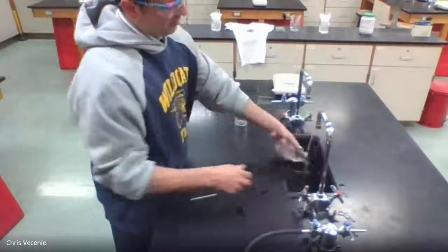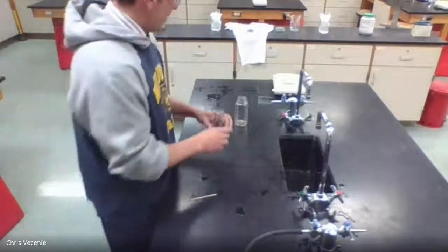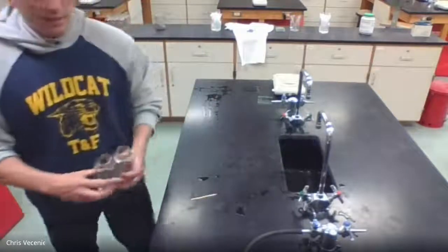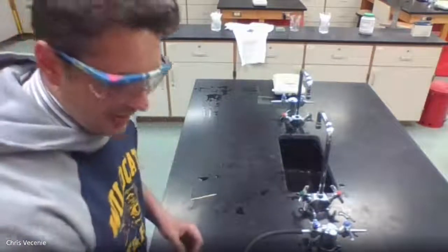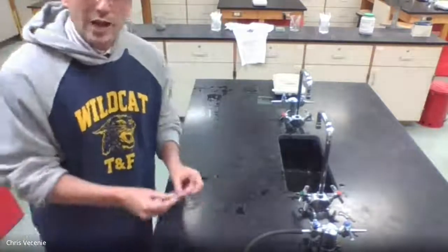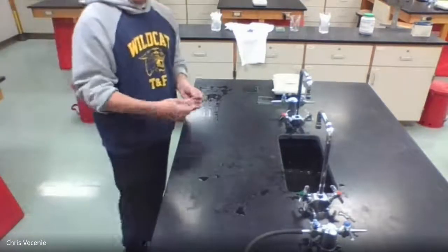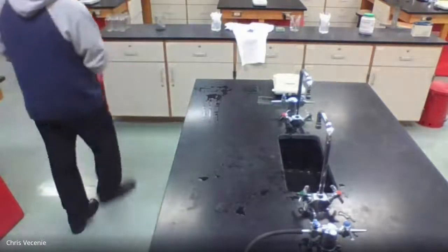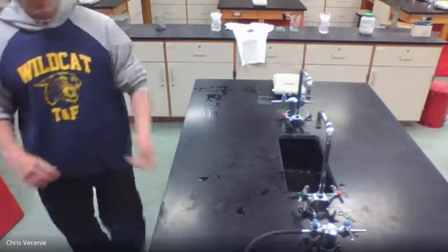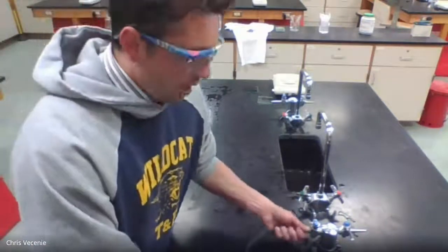And like you said, you never get to control the results of your experiment. Sometimes we see what we think we're supposed to see, but at the very least, we always have to explain our observations correctly. If I went and said, yeah, sure, our hydrogen diffused, that doesn't make sense based on what we saw. All right, so the key is making observations based on what you see.